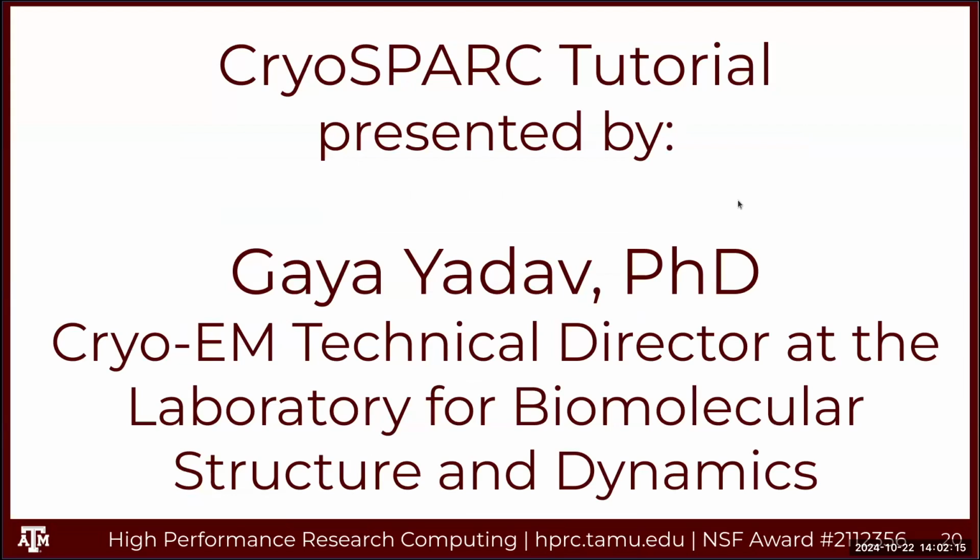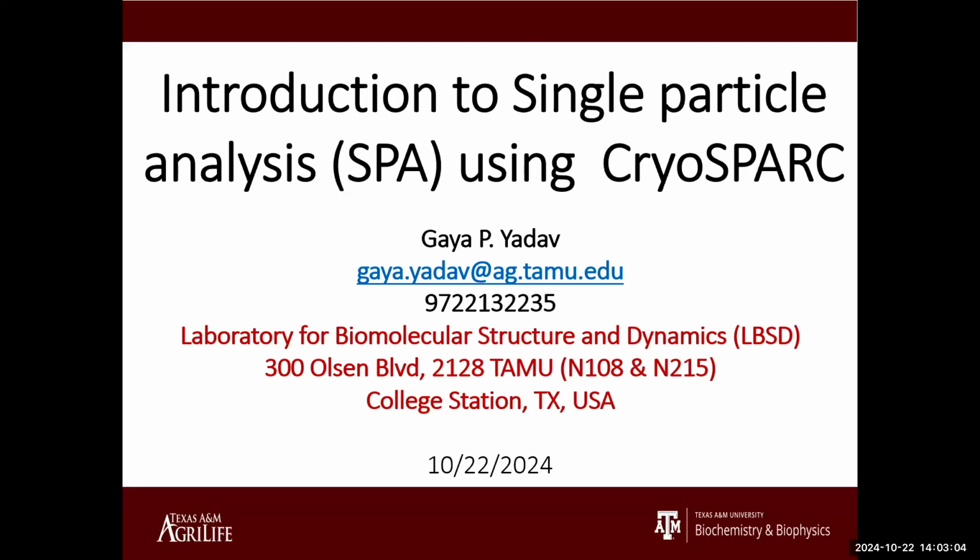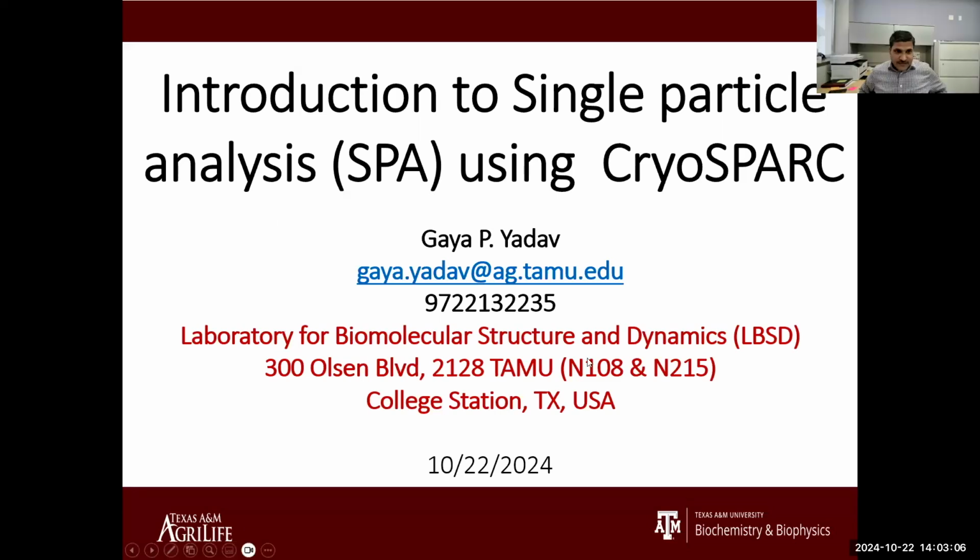All right, so we'll go ahead and go to the second part of the course, and this will be presented by Gaya Yadav. He's the Cryo-EM Technical Director at the Laboratory for Biomolecular Structure and Dynamics here at Texas A&M. Can you enable this screen sharing? Okay, so thank you, Mike, for the introduction.